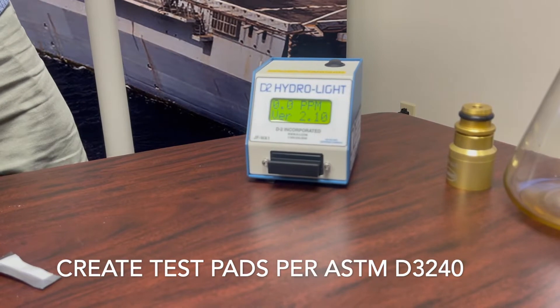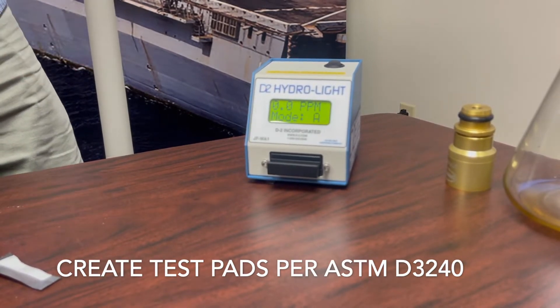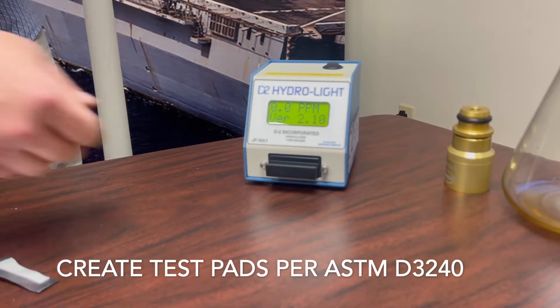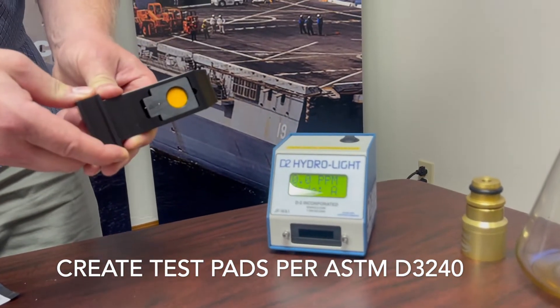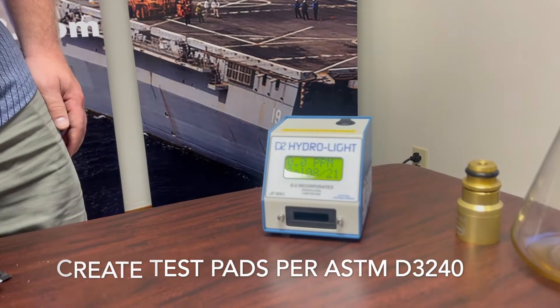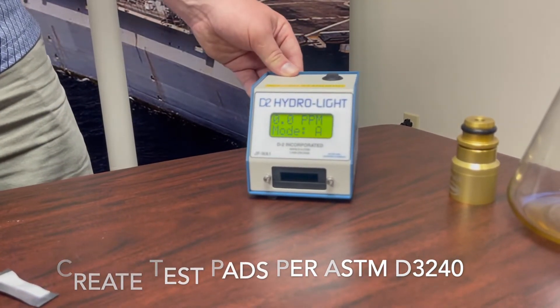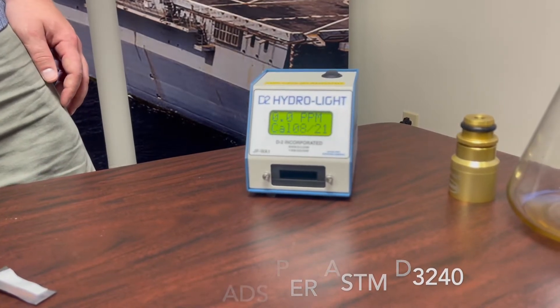The instrument will then provide a reading. As this is an unused test pad, it's showing a reading of zero, as it should. The pad should always be face up in the shuttle — orange side face up, or colored side face up. Always follow ASTM D3240 when taking a fuel sample.